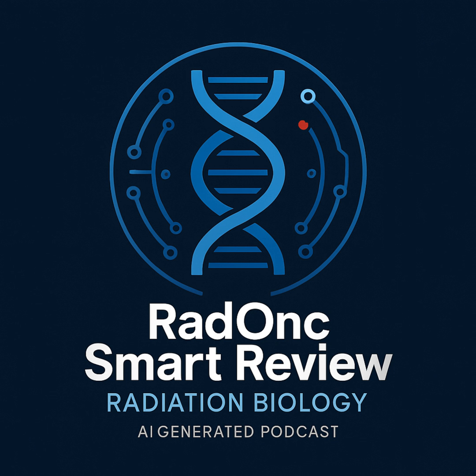Okay, Illumina uses sequencing by synthesis. First, you prepare a library. You fragment your DNA sample into smaller pieces and ligate, or attach, short known DNA sequences called adapters to the ends of each fragment. Okay, adapters on the ends.